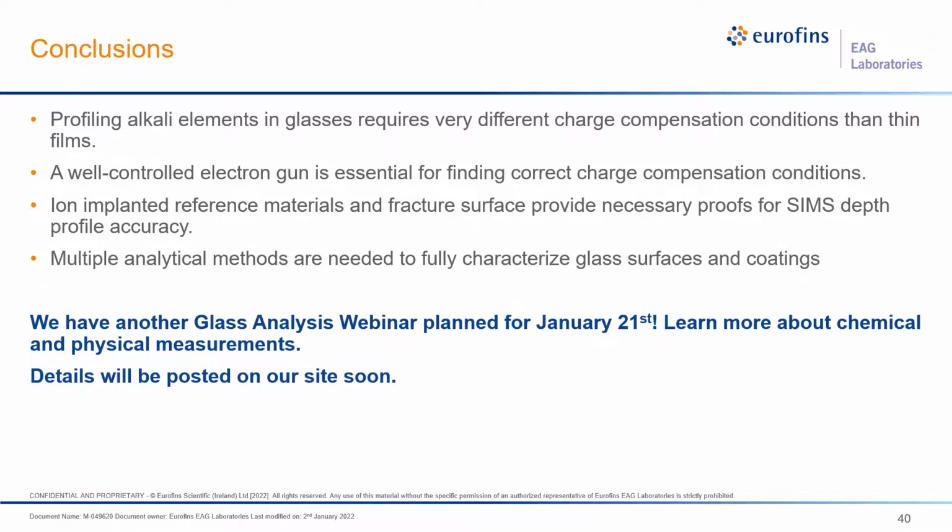I wanted to inform you that we actually looked at the tip of the iceberg today. We just looked at the very top surface of the glasses. We have another glass webinar coming up on January 21st, where we're going to look at the bulk properties of these glasses and show you how we do chemical and physical measurements on these. For details, please look at our EAG website.